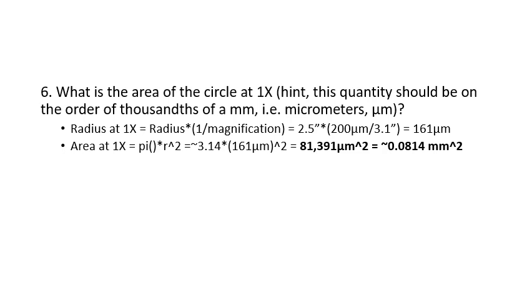So then I calculate the area at 1x, pi r squared, 3.14 times 161 micrometers squared, and I get 81,000 square micrometers, or about 0.0814 millimeters squared.